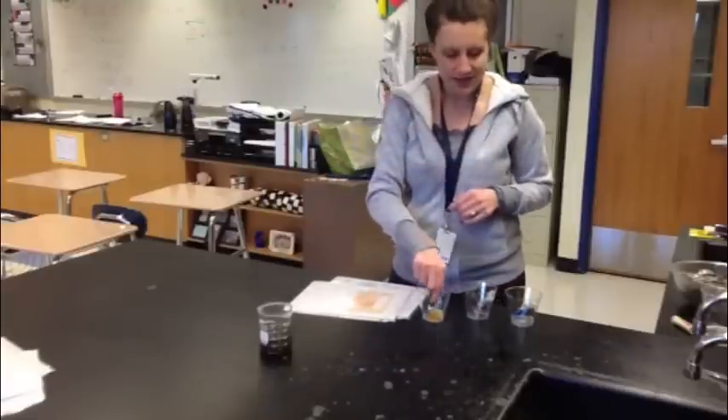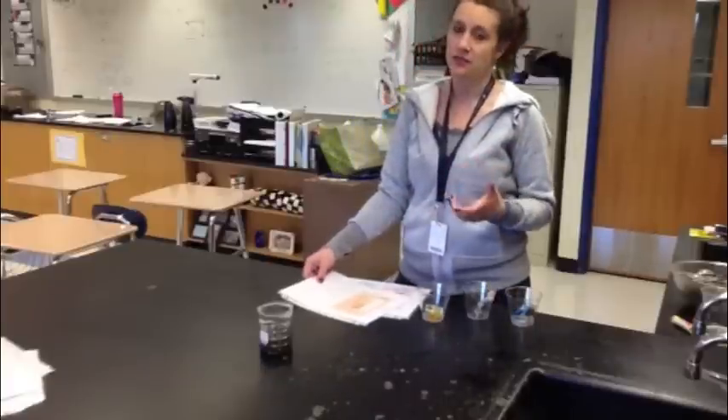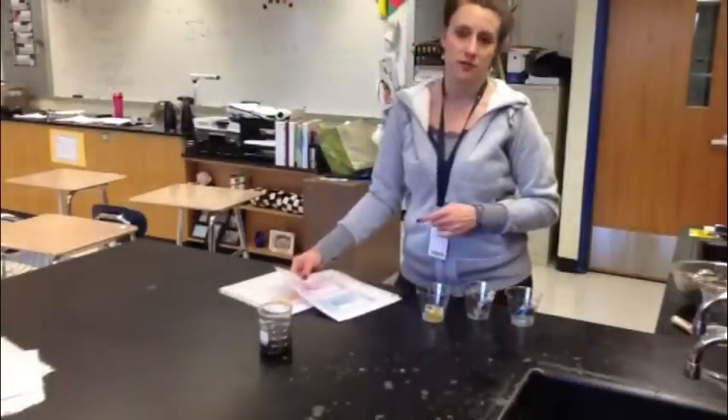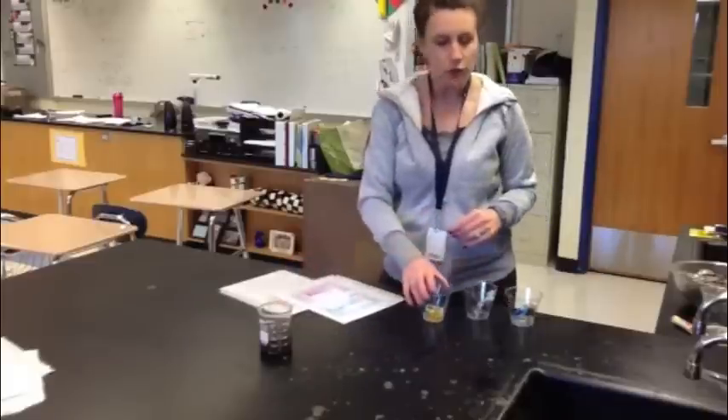Same exact kind of thing. For this test we are going to be trying to find out how much potassium is in the soil, which has the symbol K; how much nitrogen is in the soil, which has the symbol N; and how much phosphorus is in the soil, which has the symbol P.